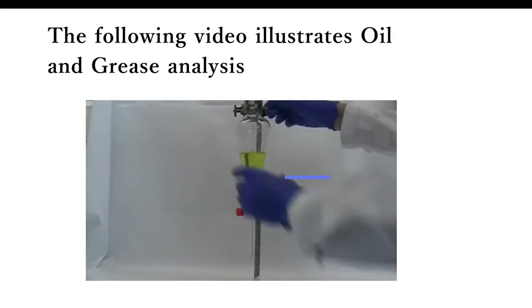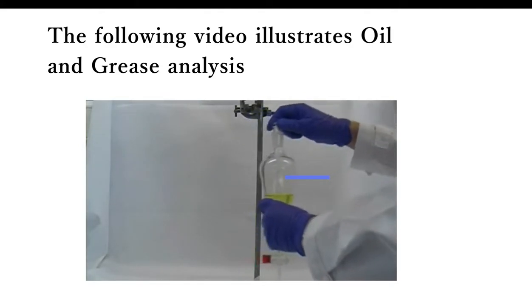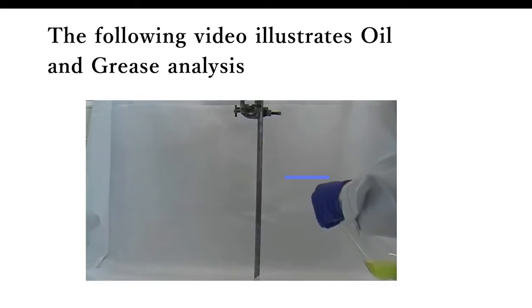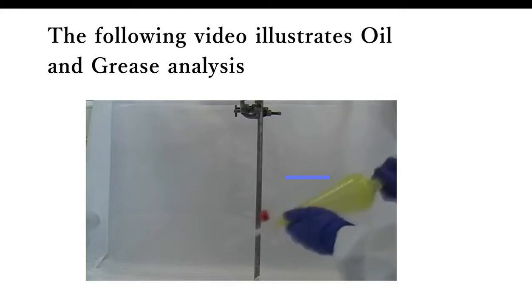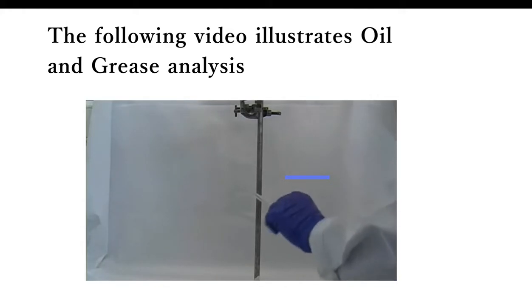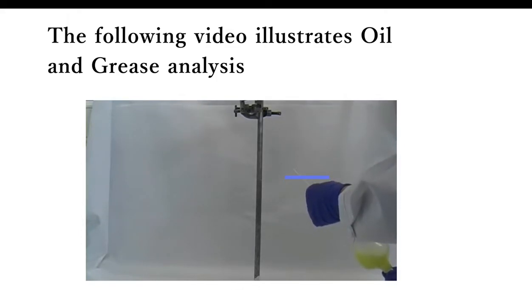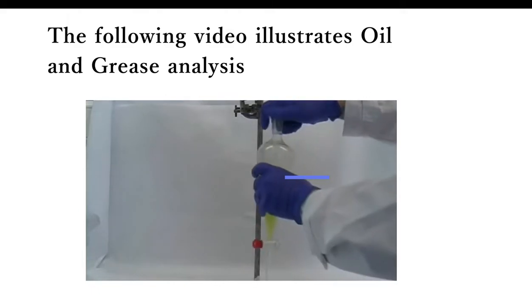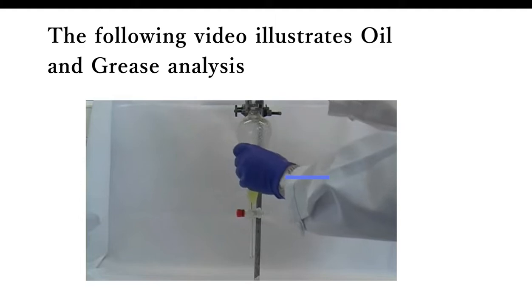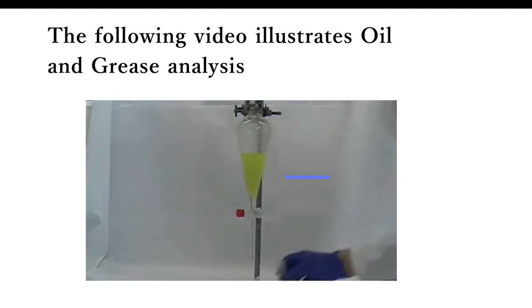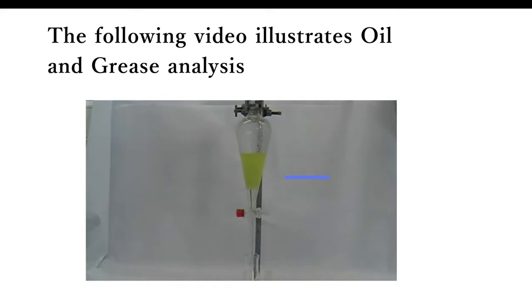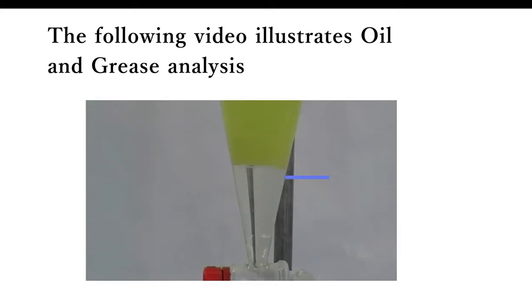After removing the funnel, stopper the separatory funnel and hold the stopper firmly in place while you turn it over. As you can hear, some pressure builds up that needs to be vented. The same happens after you shake the solution. After venting and swirling a little to aid phase separation, clamp it again in the retort stand. Importantly, remove the stopper — otherwise pressure will build up and force the solution out at the sides. Phase separation takes some time; you must be patient until no further separation is visible. The time required depends on the nature of the solute and solvents.